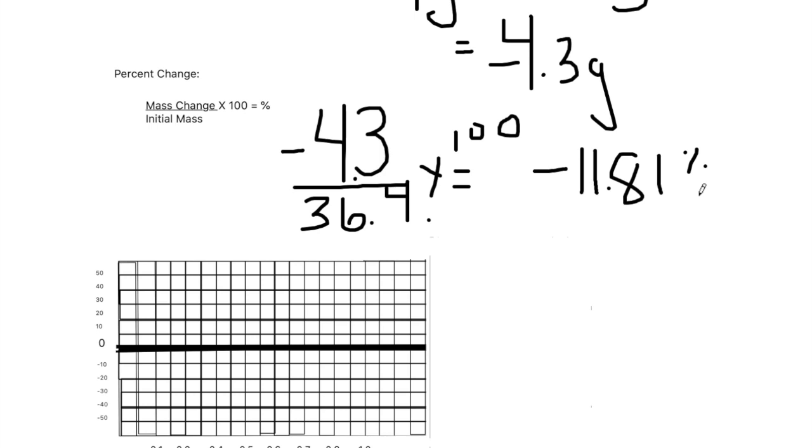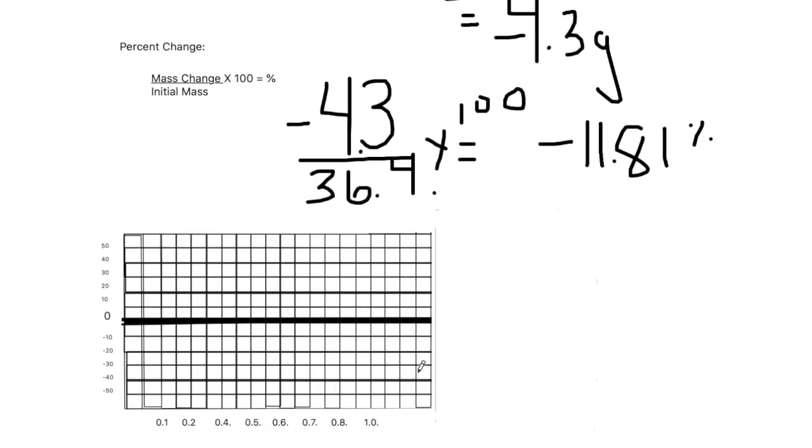Now, because the first beaker with the 100%, 0% fructose, so all water, unfortunately, we were not able to get the mass of that because the egg did break. So one of the things that we did observe beforehand was that the egg was very, very full. So there would have been a positive percent mass.